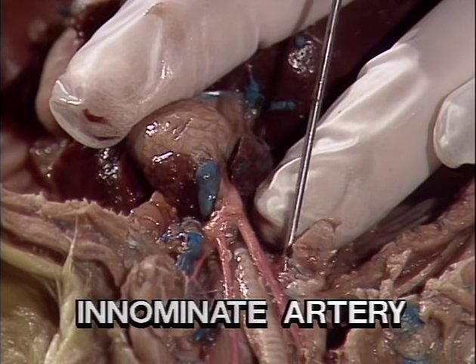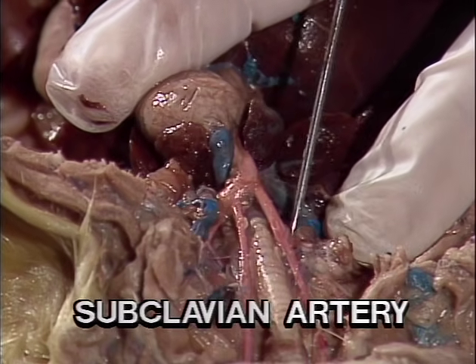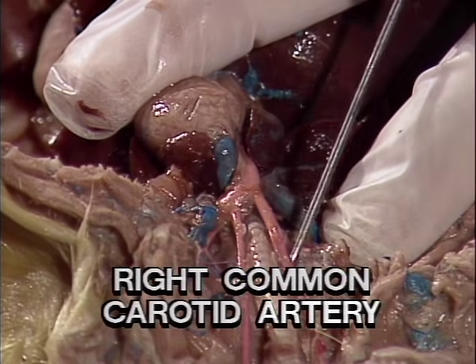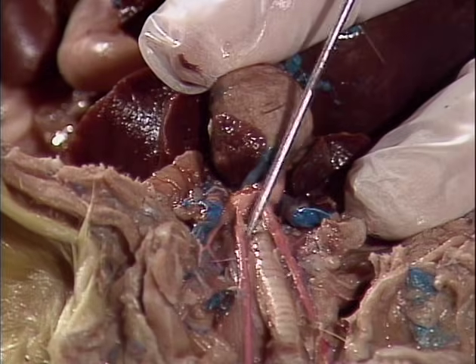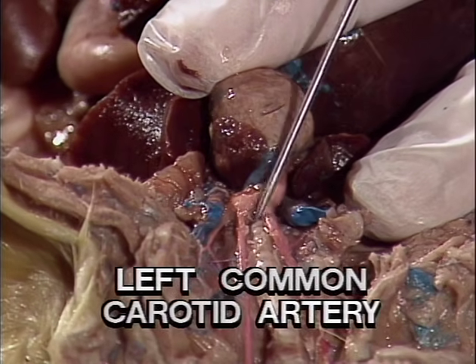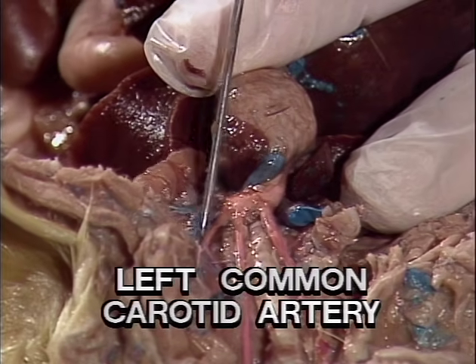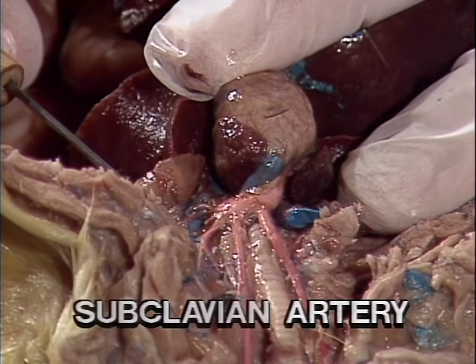It's quite short and branches immediately into the subclavian, which goes into the shoulder, and the right common carotid artery, which goes up towards the head. This branch is known as the left common carotid artery, which also goes up towards the head. And here we see the left subclavian going into the shoulder.